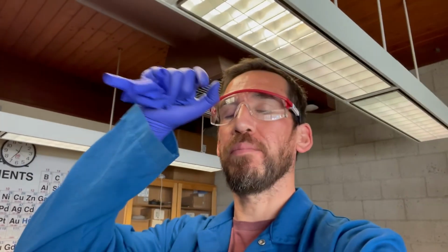So we are good to go. We converted our Benzoin to Benzil, most likely. Y'all gotta write about it, prove it to me. It is a formal lab report this week, so make sure you do that. I'll get you the PDF of the IR. We did a melting point. I didn't really talk through that because y'all can figure that out. But then, yeah, there were some errors, probably some stuff that went along.